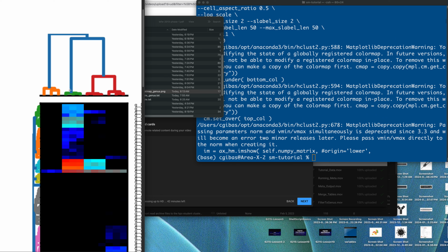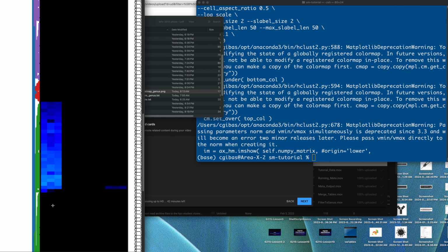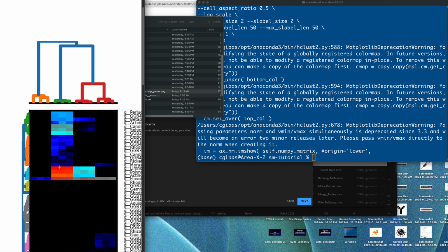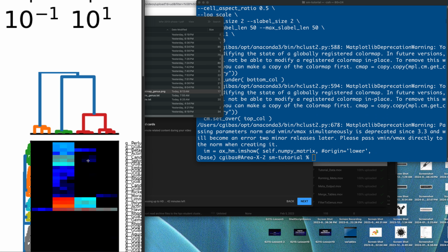And the upstream site is isolated somewhat from the other samples as well, because that is the stream prior to any introduction of treated wastewater. So that makes sense from that perspective. That's what we get if we make a simple heat map out of this data that we've collected for the stream microbiome project.